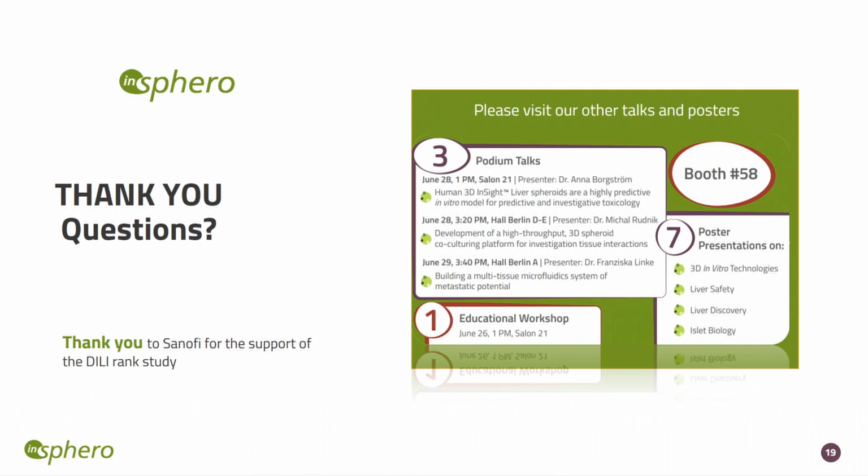So we are always performing a quality control in the beginning. We use these big cell lots, and we have many quality control steps in the beginning. So we know that our model is always performing according to our standard criteria. We are not matching our multi-donor pool with the non-parenchymal cells, so this is not a step in our production.